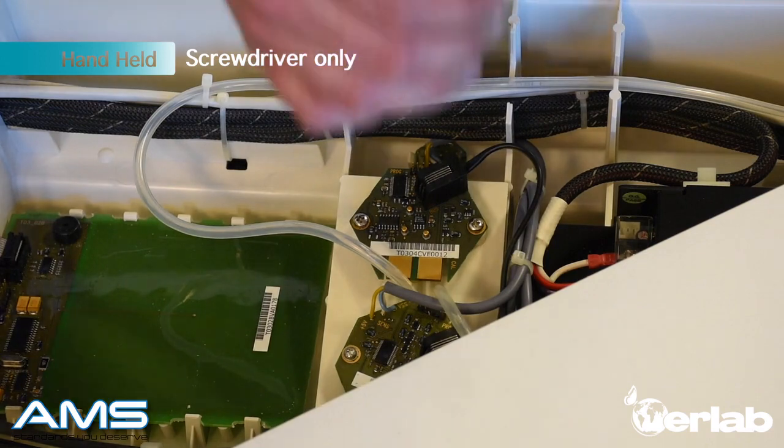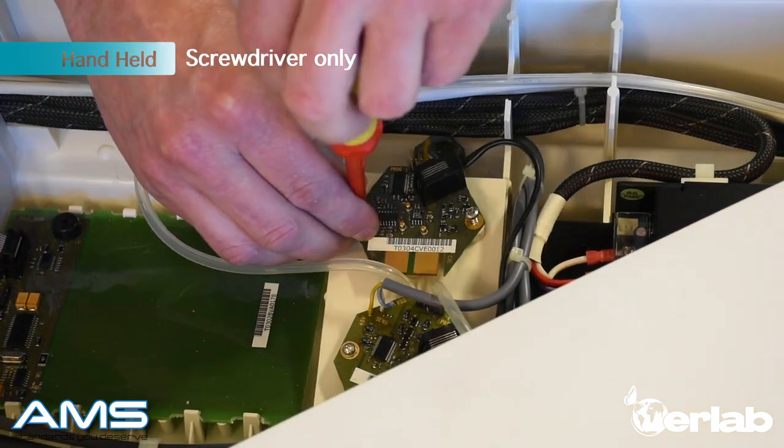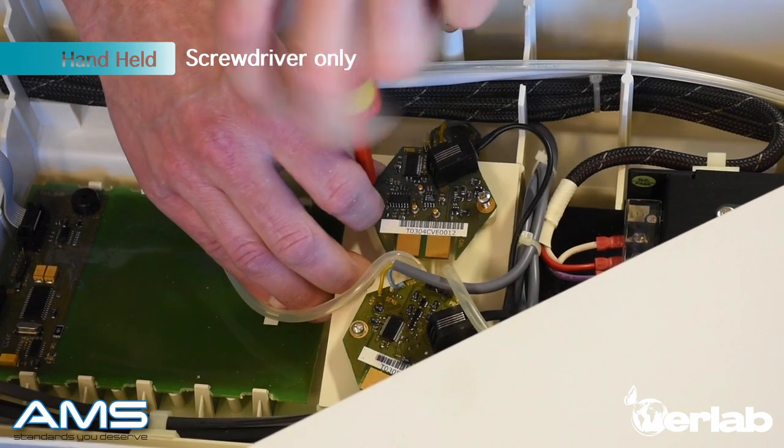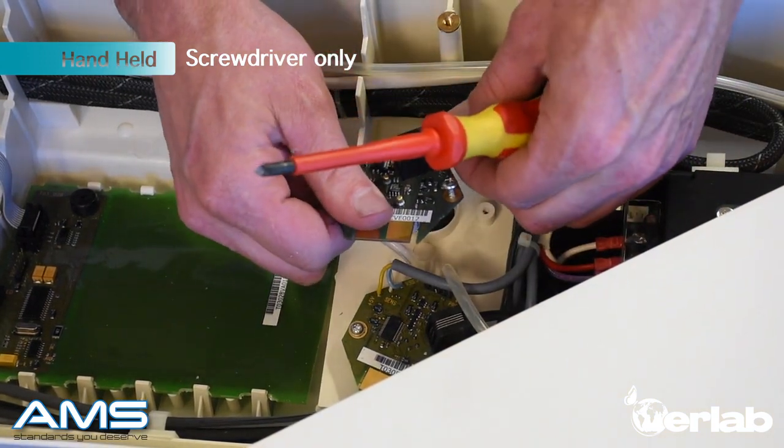Make sure you use only a handheld number 2 screwdriver — do not use a power drill. Remove the screws carefully without damaging the board. Once you have the screws removed, make sure you unplug the sensor.